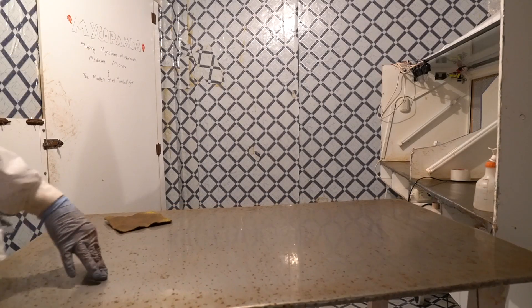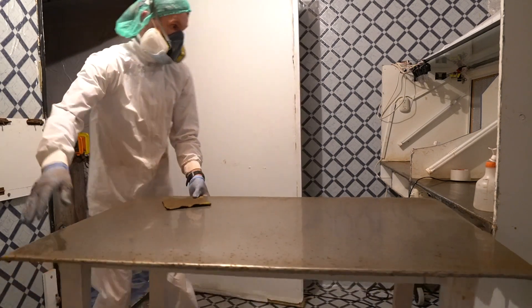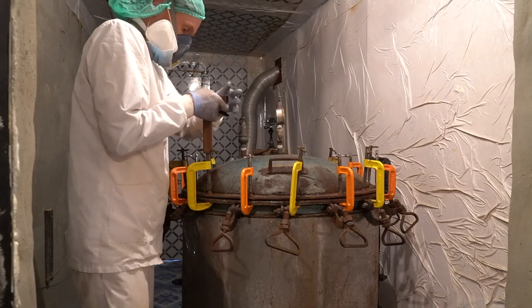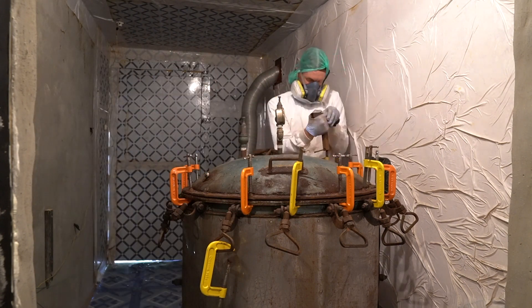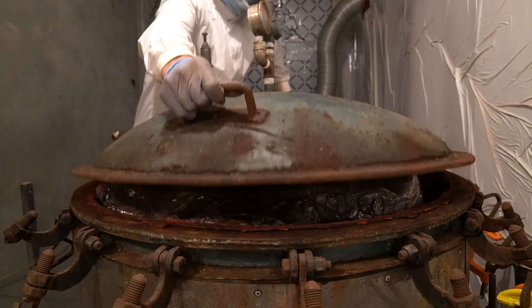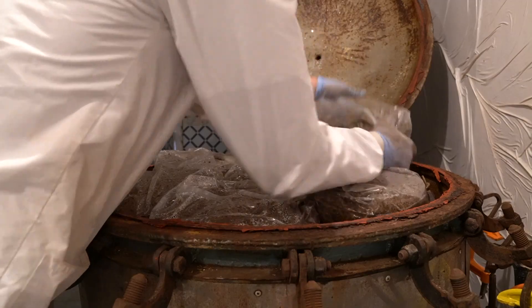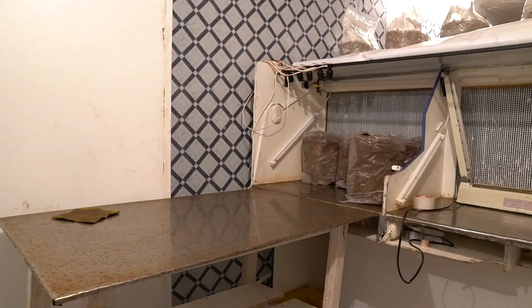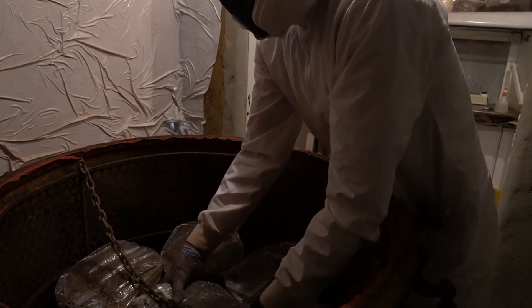I'm showing you my little DIY work floor. I have my pressure cooker and bring blocks into my clean room without needing a big double-door autoclave. There's a door on the far wall where I bring in the dirty substrate, load the cooker, do the pressure cook, let it cool for a whole day, then sterilize that room. I'm wearing a vapor mask because I use an MMS solution — chlorine dioxide — to clean the room and make it safe to bring the blocks out onto the laminar flow hood.